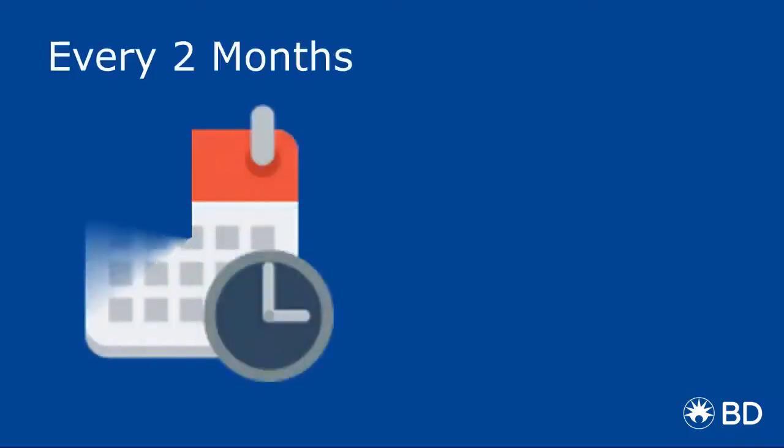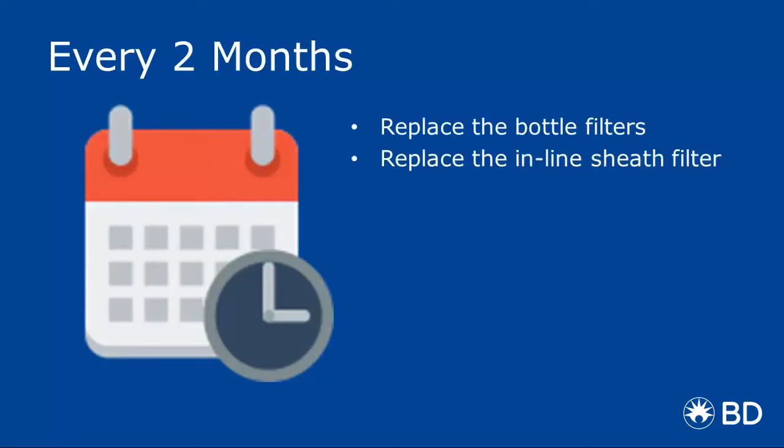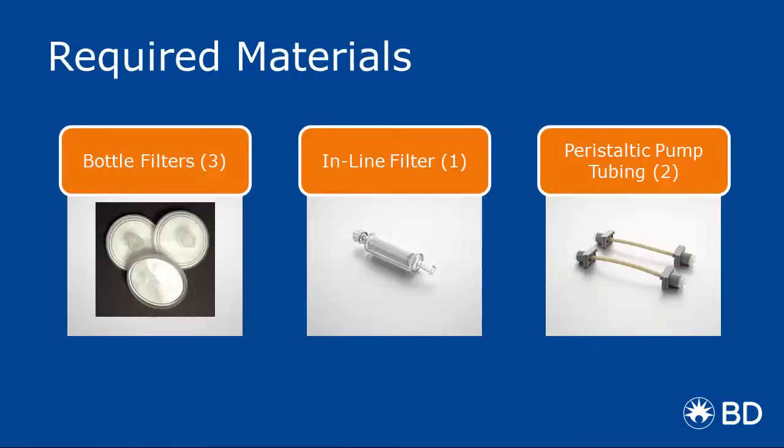Every two months, you'll need to replace the following: bottle filters, inline sheath filter, and the peristaltic pump tubing. In order to complete preventative maintenance, you'll need a two-month or a one-year maintenance kit with the items that we just mentioned.